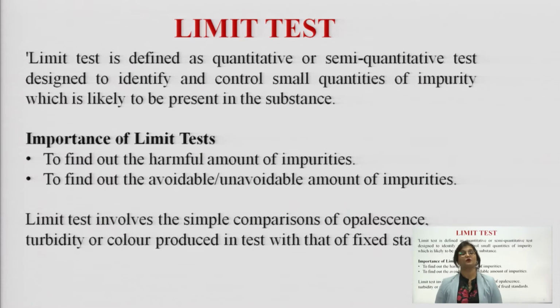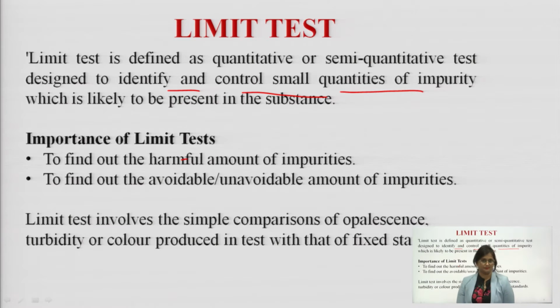It is used to identify and control small quantities of impurities which might be present in our sample substance. Okay, so what does a limit test do?